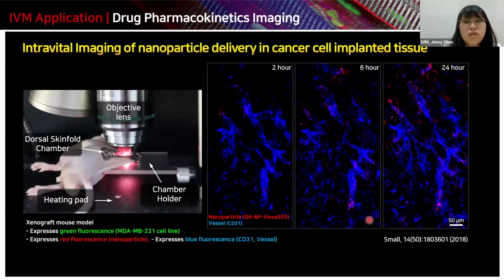Although it's not shown in the slides here, we did also some additional experiments using drug conjugated formulations, demonstrating that these modified drugs exhibited significantly enhanced anti-tumor efficiency compared to the conventional forms of such drugs for targeting tumors.